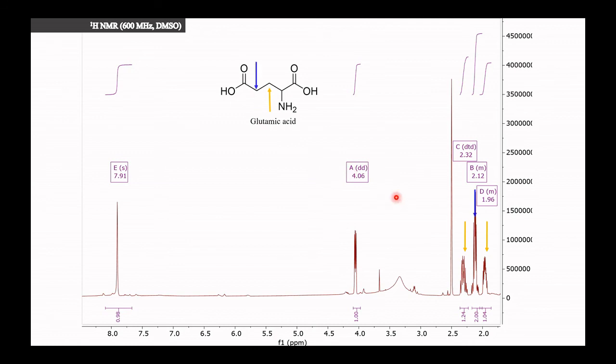If you go further, the proton next to proton, magnetically chemically equivalent, right? Next to proton, it is more deshielded. Why? Because it is alpha to the amino group. Finally, you will see the NH2 at this chemical shift. If you would like to prove NH2, now you recall it, then you can add D2O, and this chemical shift, the peak will be changed or will disappear.